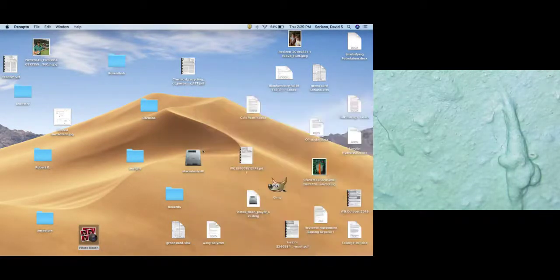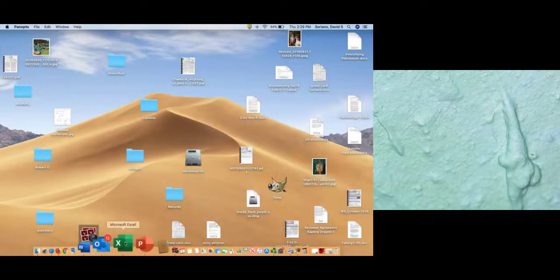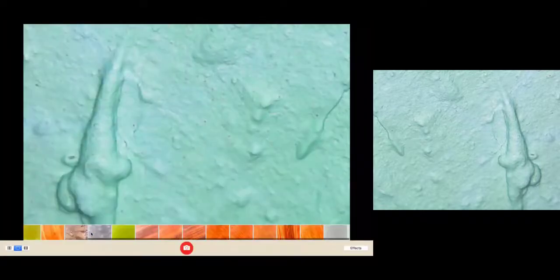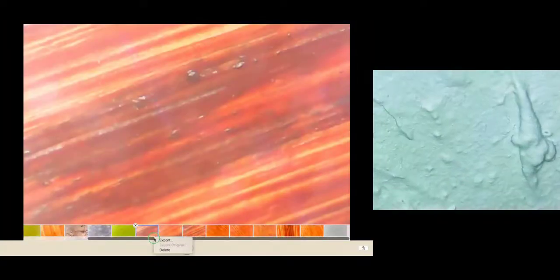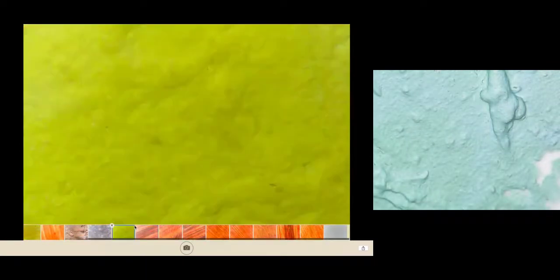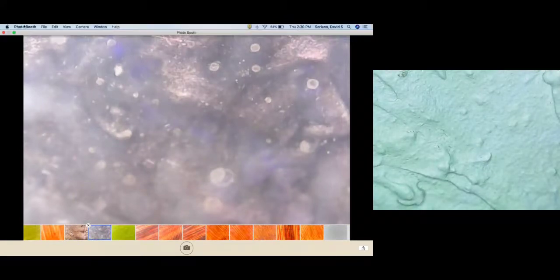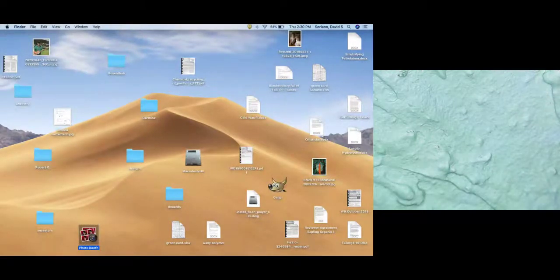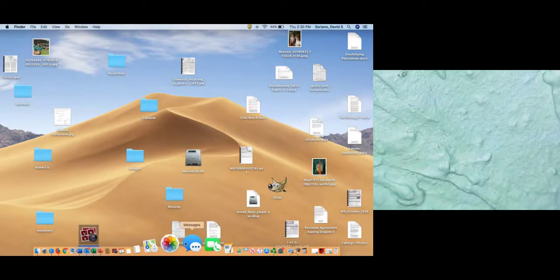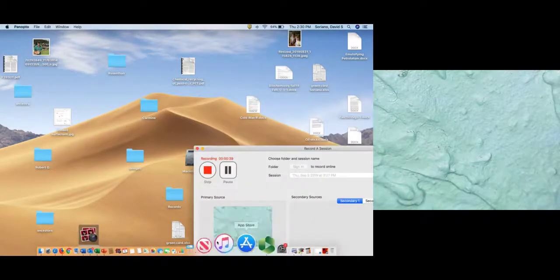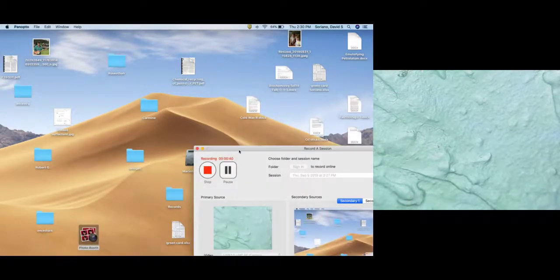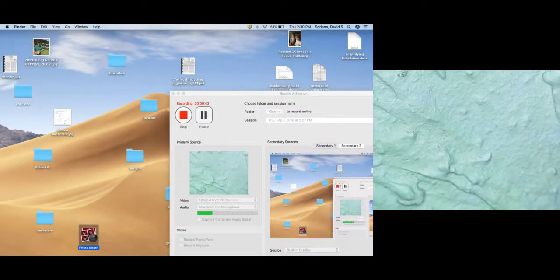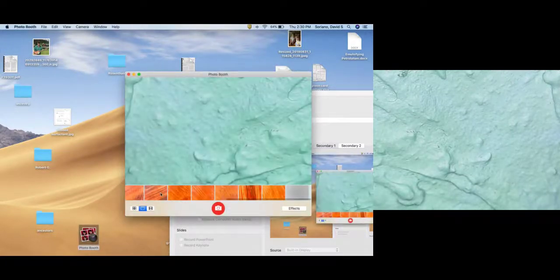And I'm capturing some imagery of paint formulations that I'm preparing. Let's see if we're still connected, okay, all right, now we're getting there, there we are.